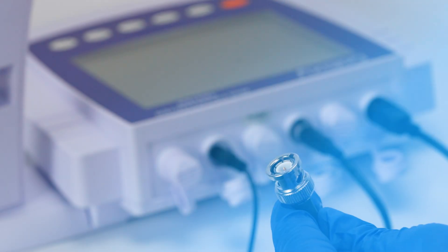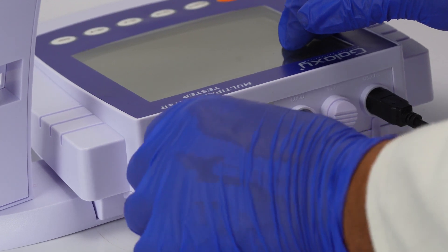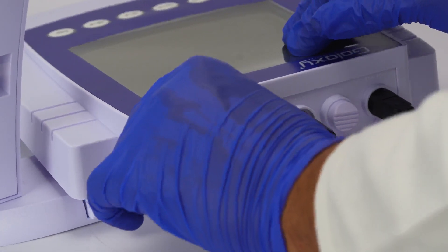Connect the pH, ORP, or ion selective electrode to the socket labeled PHISE.